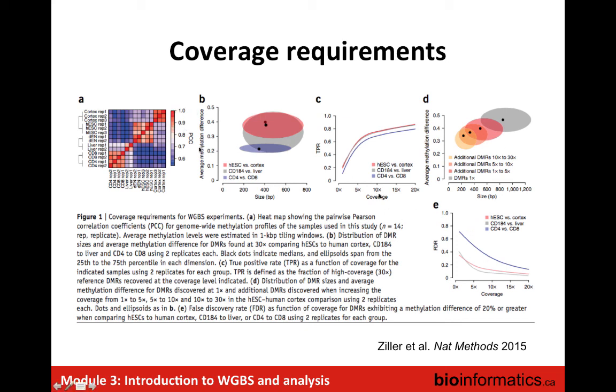This is another analysis looking at the false discovery rate, which decreases, as you would expect, as you increase coverage. Obviously, the more coverage you have, the more accurate, and the smaller the regions you're able to detect, but it's a balance between cost and what you can afford to do.